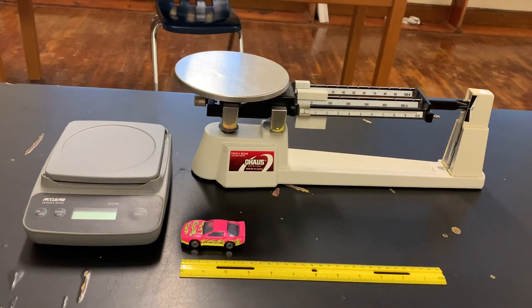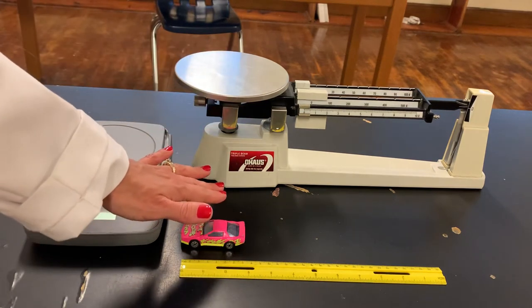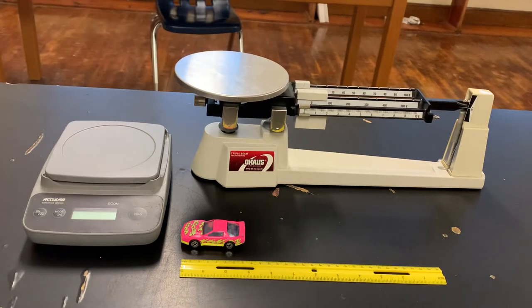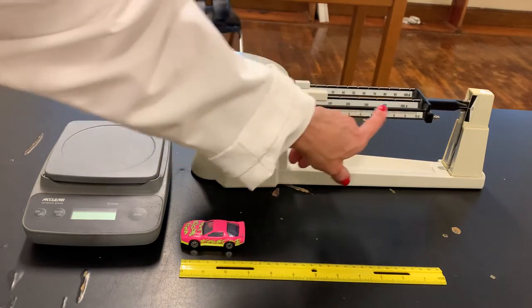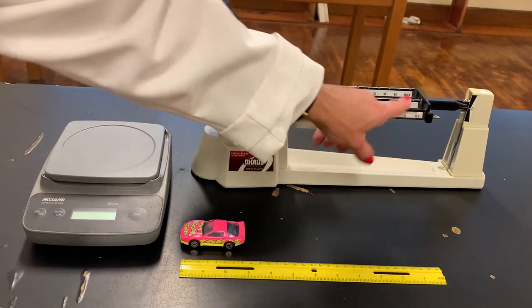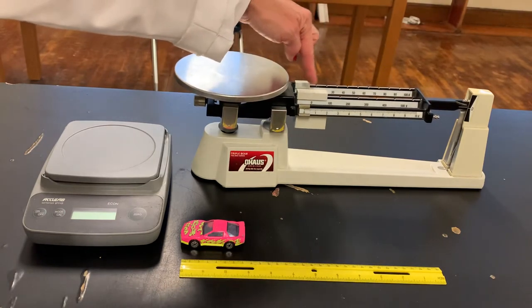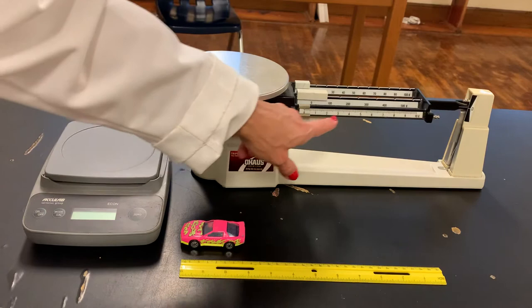Here's the pan on which we're going to put the car to weigh it. You'll notice it has three different beams — hence triple beam balance. Over here there's a scale of numbers: the first one goes from zero to ten, the back one goes from zero to one hundred, and the middle one goes all the way to five hundred grams. You have to look at the object you're weighing and decide which scale or beam to move first.